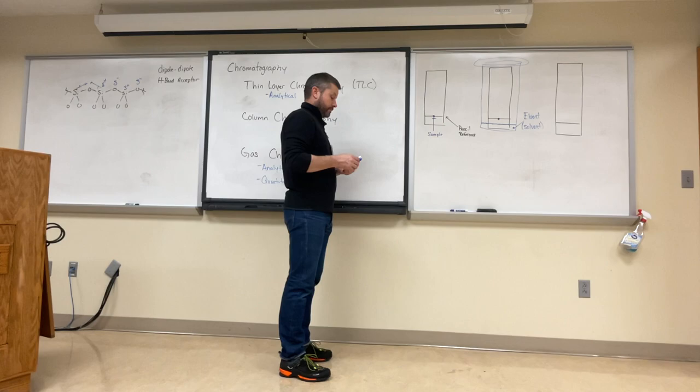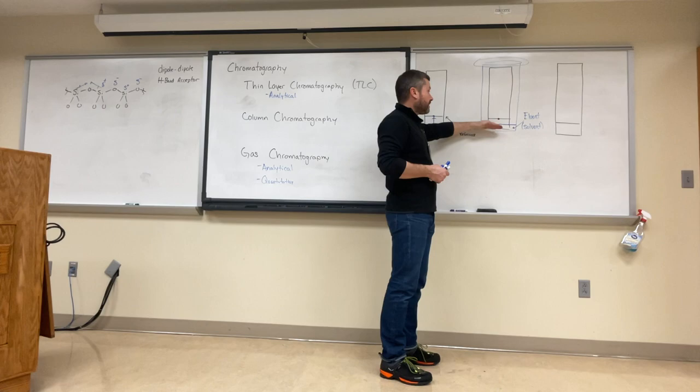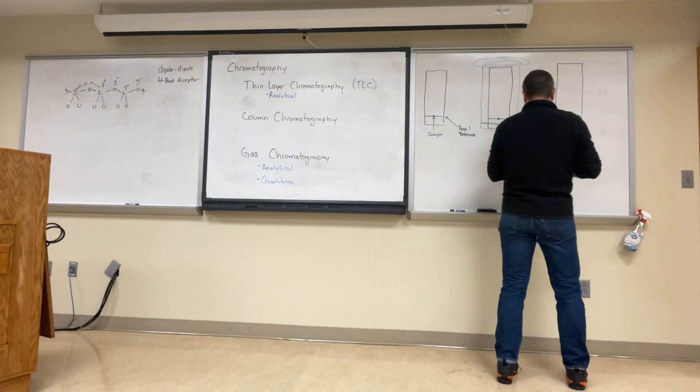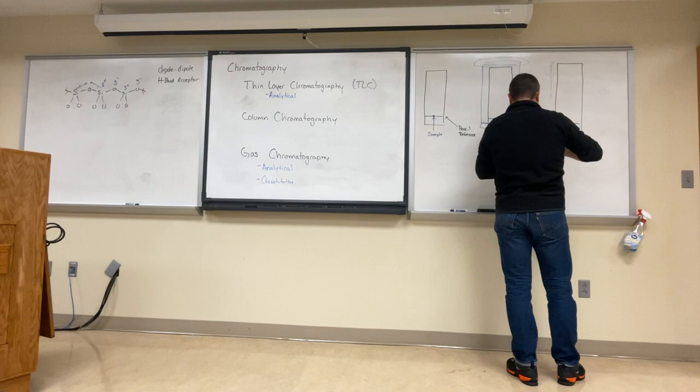And what that solvent is going to do is soak into the silica gel, and as it soaks into the silica gel, it's going to climb up the plate through capillary action. So if you put just the tip of a paper towel in some water, the water's going to climb up the paper towel, eventually the whole paper towel will get wet. And as it climbs up the plate, it's going to carry your sample with it.